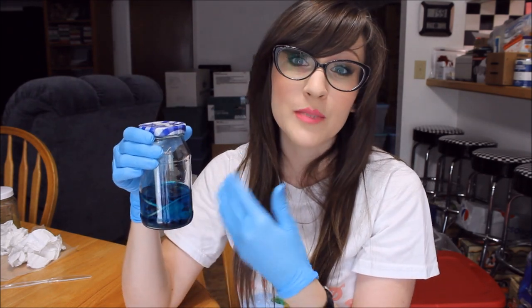Any parts that are exposed above the solution will not be stained. Be super careful not to overstain your specimen. Overstaining will prolong and complicate the clearing process that we have to go through in order to see the bones and cartilage. On a side note, you can use the Alcian Blue solution that you just made many, many times. But when the Alcian starts to fall out of the solution, so when you start to see little buildups towards the bottom of the jar and in the solution, then you want to throw that out and replace it with some new Alcian Blue solution.